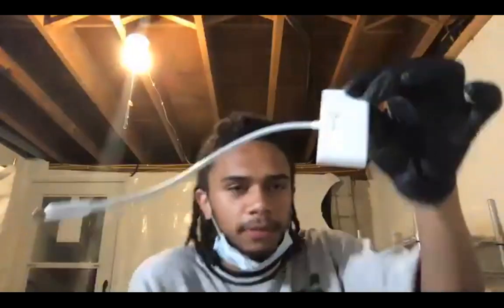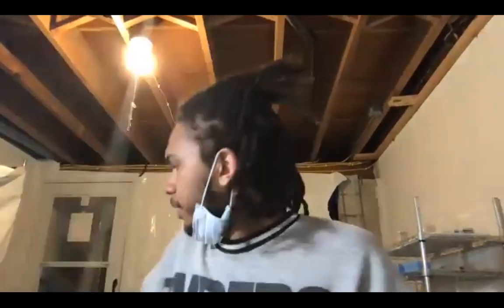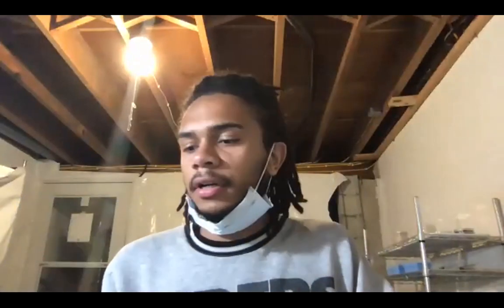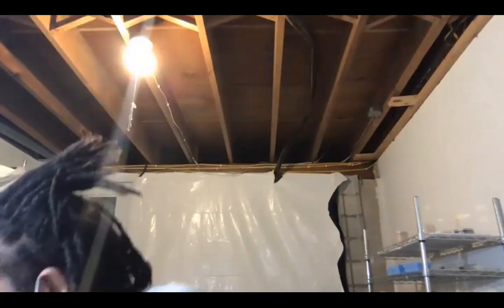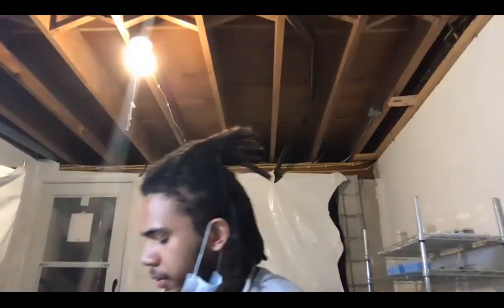All right, stupid little USB adapter thing for these new MacBooks. All right, so I'll plug in that thing. And then there's a USB to USB that goes in the back of the PCR. This is to program the PCR, so it knows what it's supposed to do. And then, oops, I'm gonna unplug that, because it can turn on off just the USB power. I want it to be powered on its own. So I'm gonna plug this in.